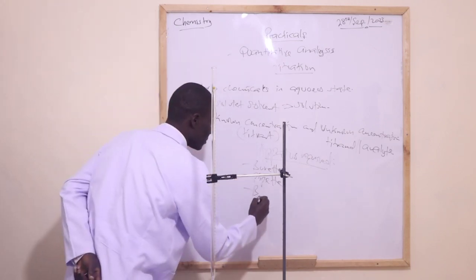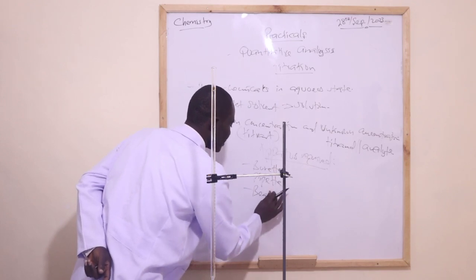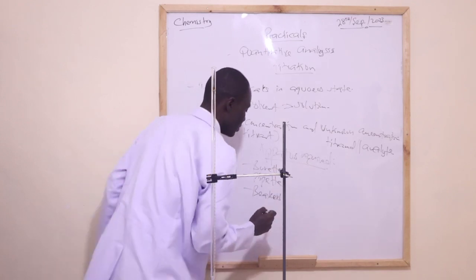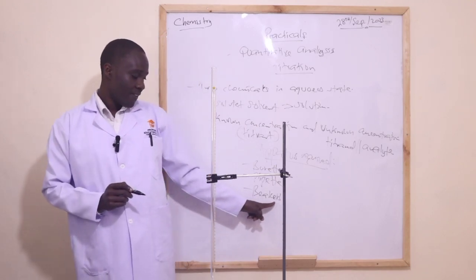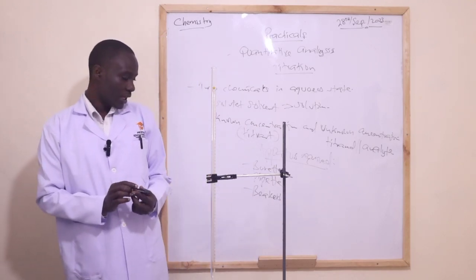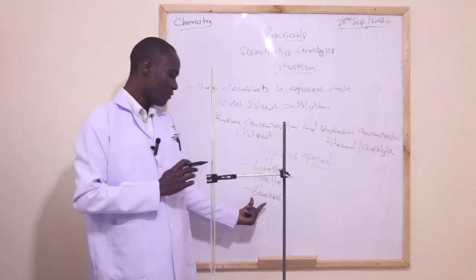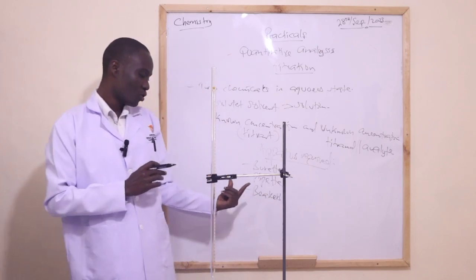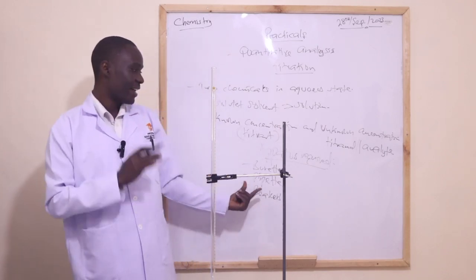So these beakers, I'll show you the beakers. They must be more than two. The first two beakers, one must be containing the analyte.